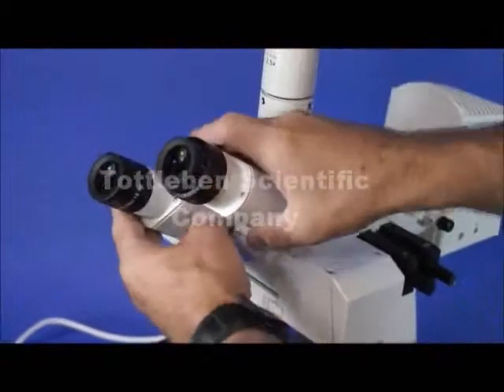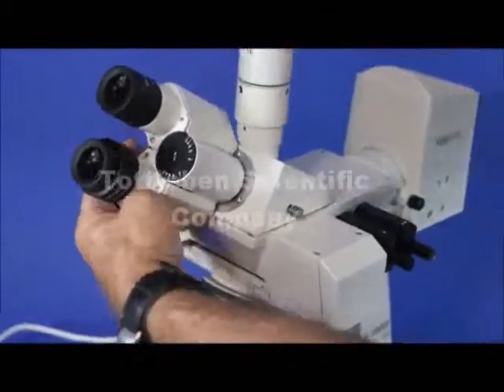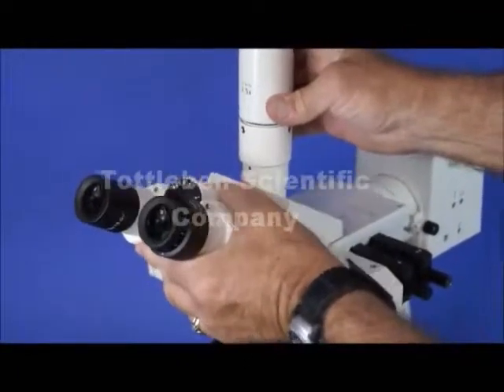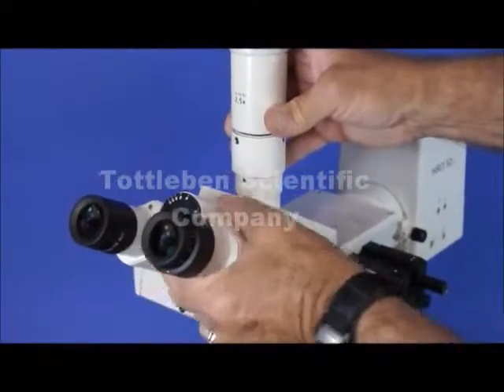This is the type of binocular that rotates 360. We can't go all the way around 360 with it right now because we have it outfitted with a 0.5X adapter for a phototube and adapting with a camera.